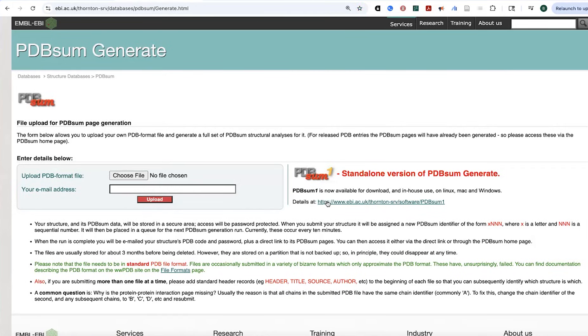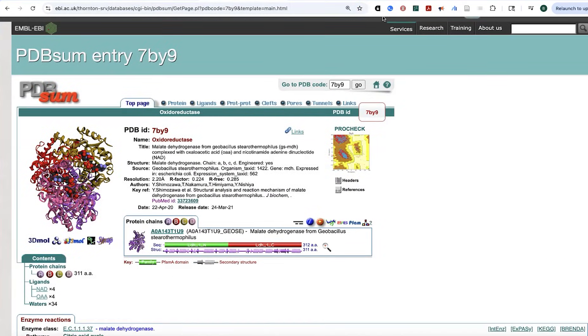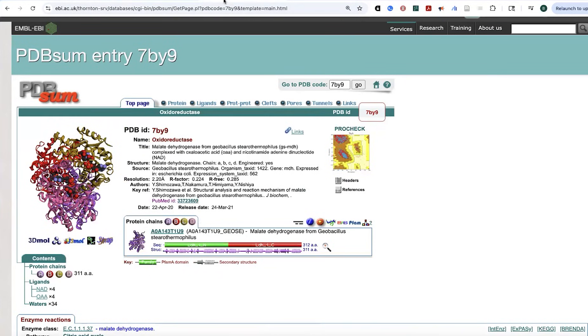And there's also a standalone version, but I've only ever used the website. But it does really quick. In this case, I went and I put in that 7BY9, that PDB ID for that entry that we are looking at, and what I get is a page that looks like this.